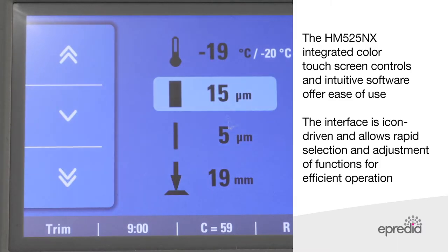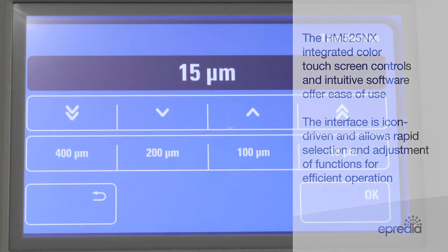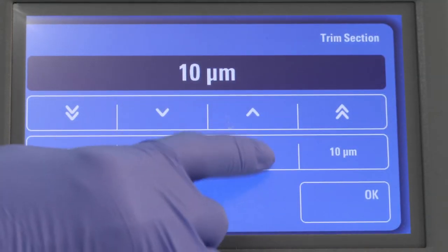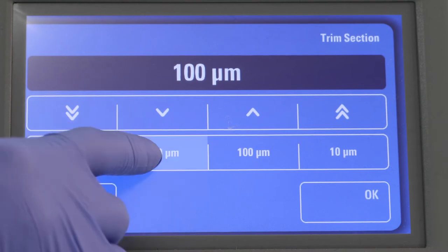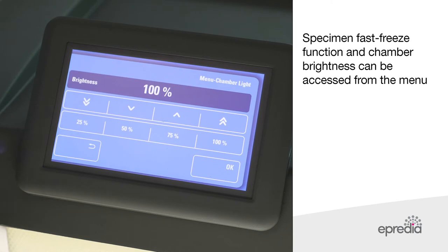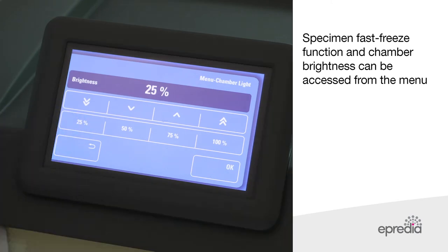The HM525NX integrated colour touchscreen controls and intuitive software offer ease of use. The interface is icon-driven and allows rapid selection and adjustment of functions for efficient operation. Specimen fast freeze function and chamber brightness can be adjusted from the menu.